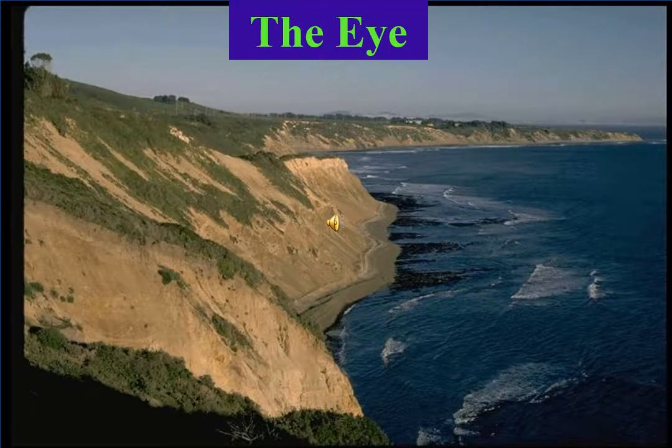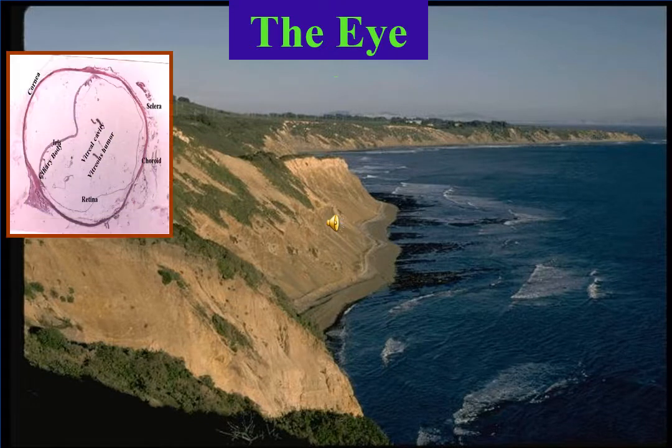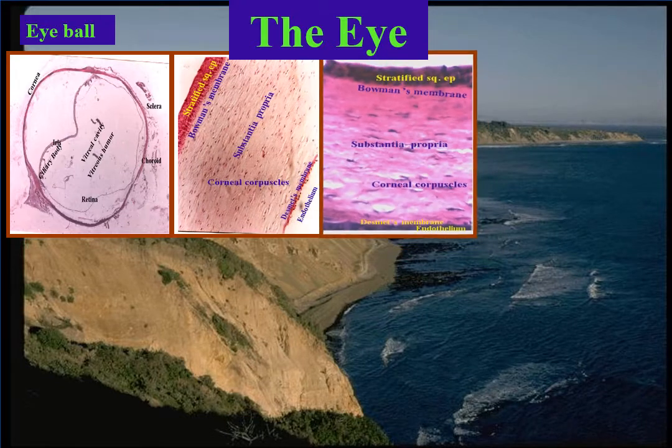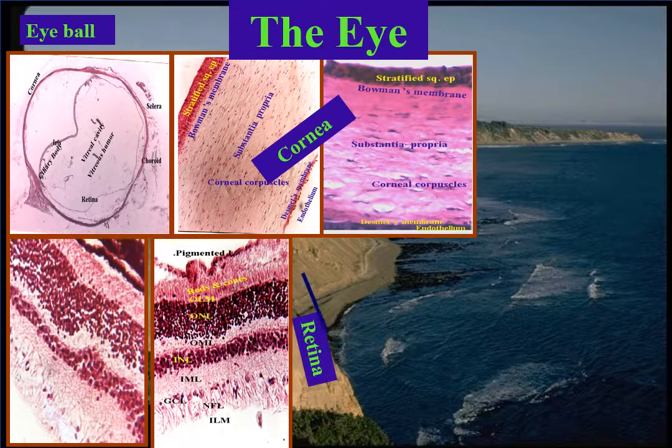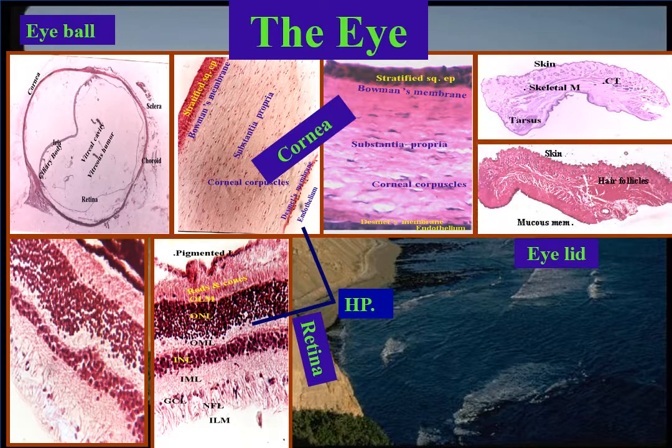Slides for example of the eye. Eyeball, examined by naked eye and eyepiece. Cornea, examined by high power. Retina, examined by high power. Eyelid, examined by eyepiece and low power.